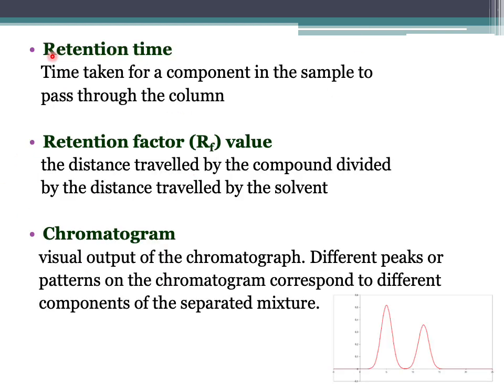Next, you must know about the retention time. So, retention time is a time taken for a component in a sample to pass through the column. Column ni stationary phase tu. So, masa yang diambil untuk komponen dalam mixture sampel tu untuk lalu stationary phase, untuk lalu satu column. Okay, tu kita panggil dia retention time.